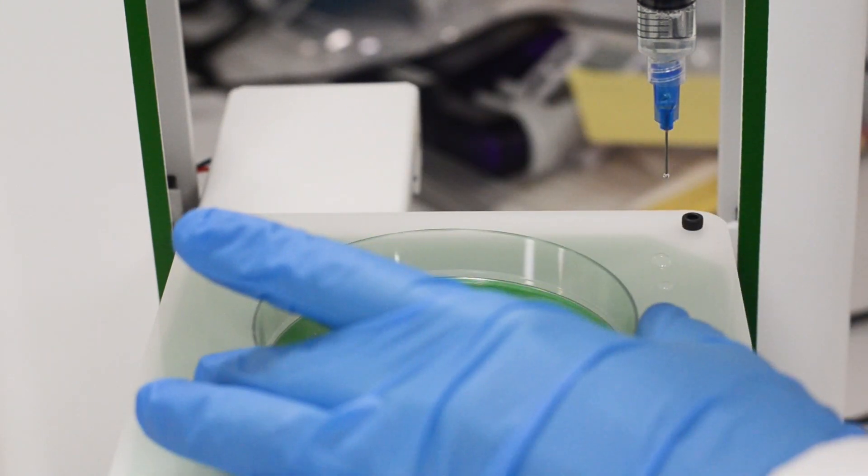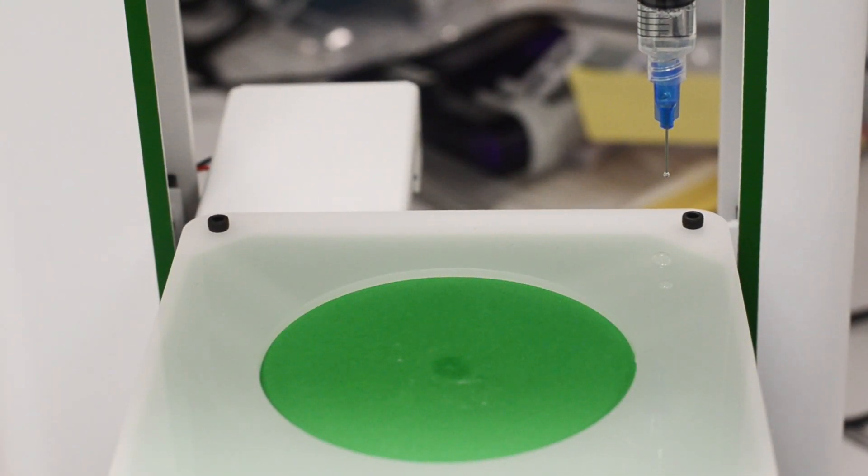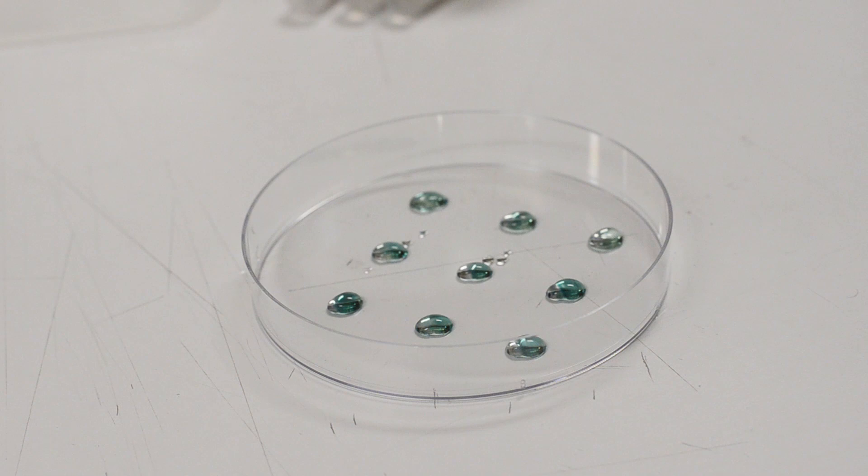Transfer the petri dish onto the lab bench and take pictures immediately. After approximately 10 minutes, the bioprinted arrays should have turned blue-green in color.